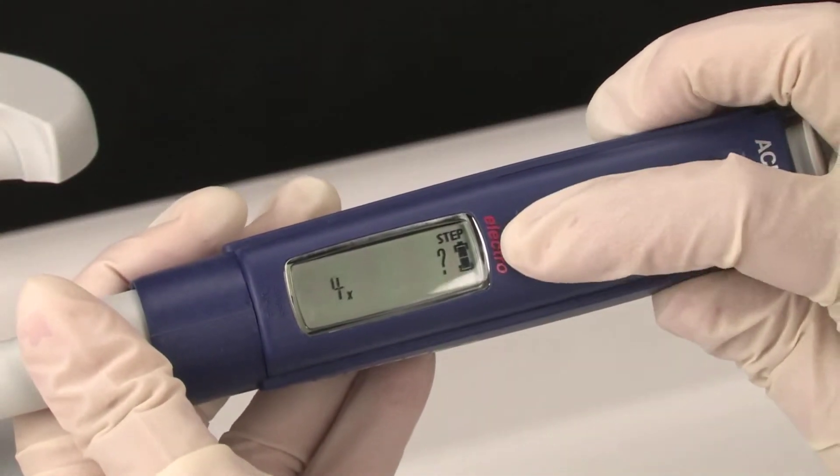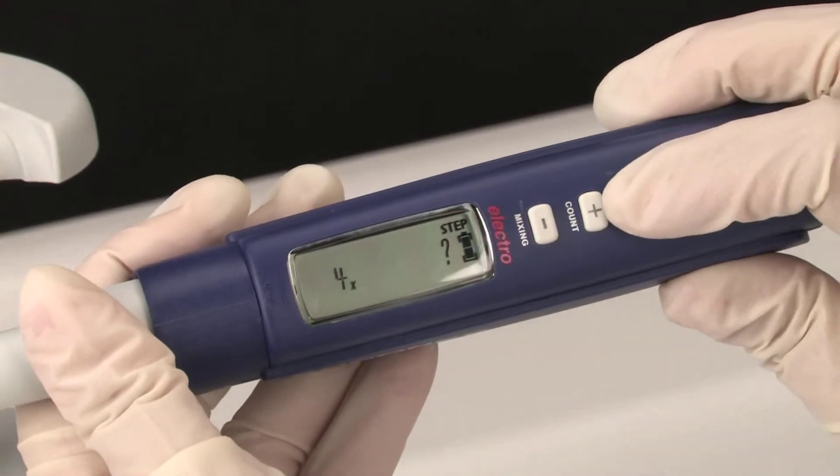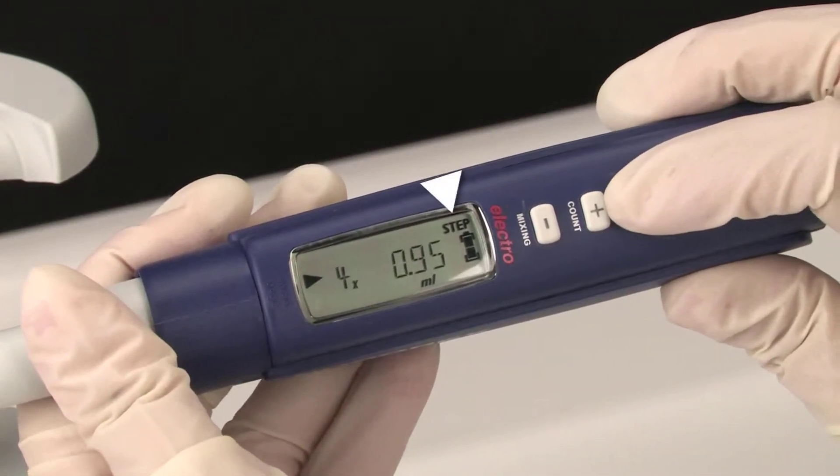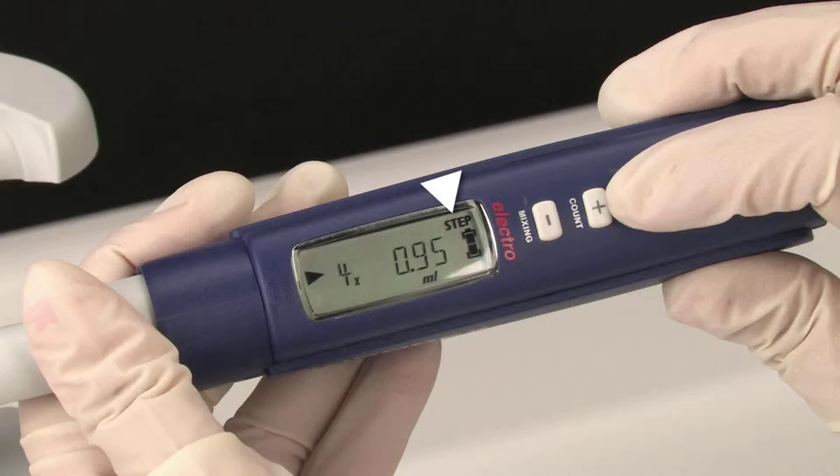The number of aliquots can also be selected using the plus and minus keys. The display now shows step, indicating the pipet is in stepper mode, along with the volume and number of aliquots selected. The triangle pointed toward the top indicates readiness to aspirate.